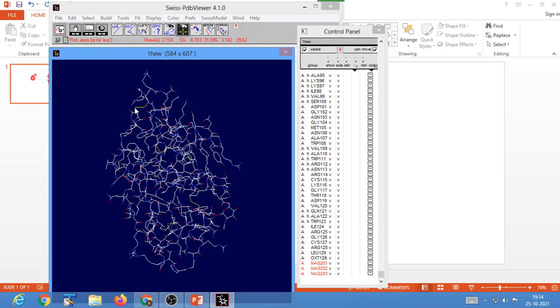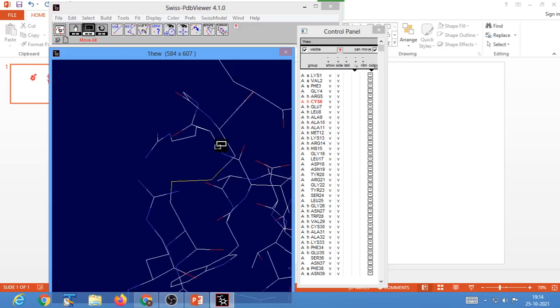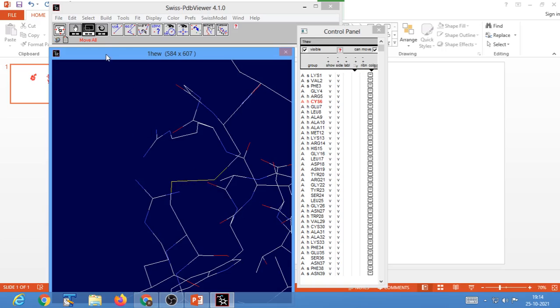If you want to identify what this is, you need to click on any of the atoms. Whenever you click on an atom using this function, the corresponding amino acid residue is selected and the center of rotation is usually placed around the selected atom. Since this is now the center of our molecule, you can zoom on it and identify whether it is still yellow or not.